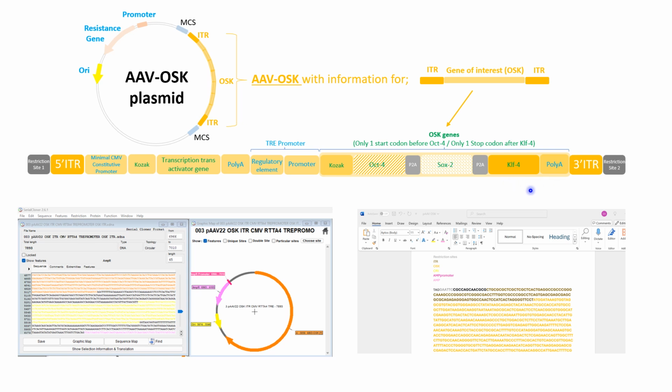And that's it. Okay, at the end of the process you will have to check with a translator that these sequences are multiples of 3 nucleotides, and the distances between these elements are multiples of 3 nucleotides. Okay, so that is what you require. Now you understand the different parts of the sequence, and what you have to do now is copy pasting. I'm going to leave the sequences below, so you can play with them separately, and also the whole sequence of the plasmid below.